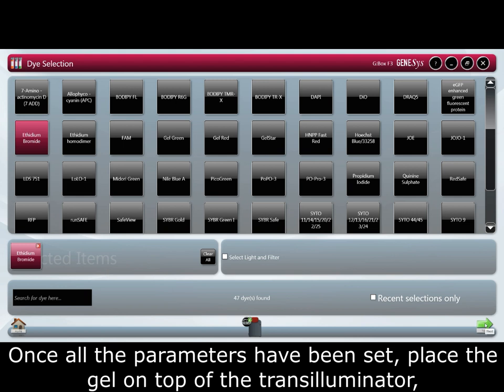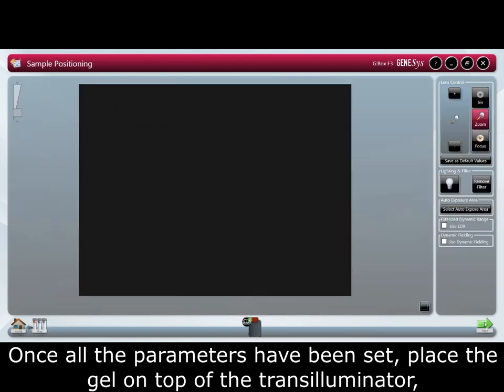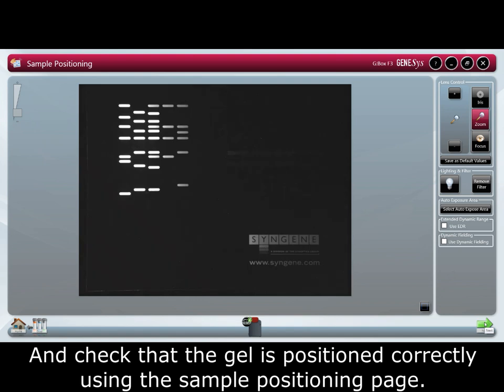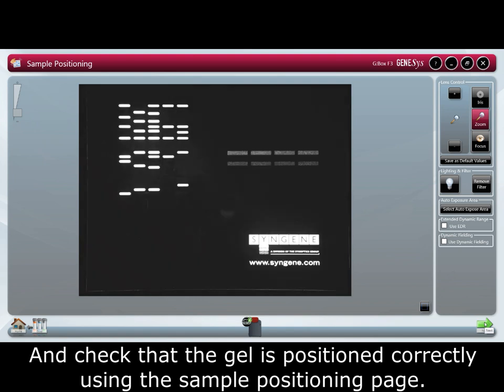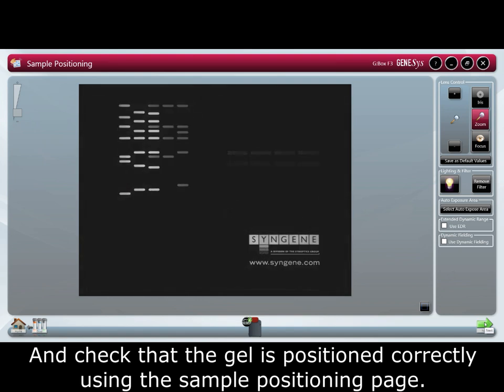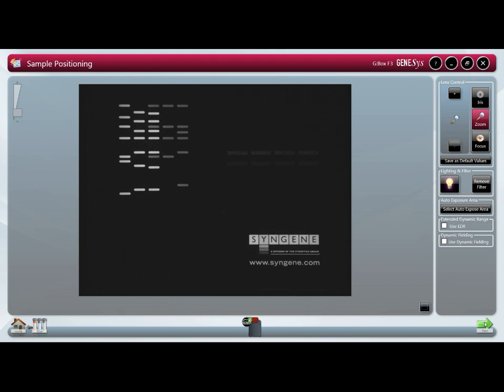Once all the parameters have been set, place the gel on top of the transilluminator and check that the gel is positioned correctly using the sample positioning page.